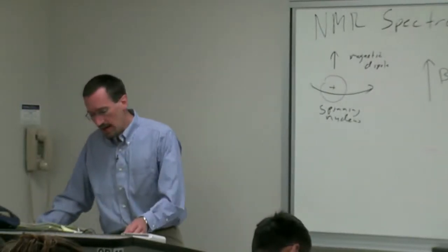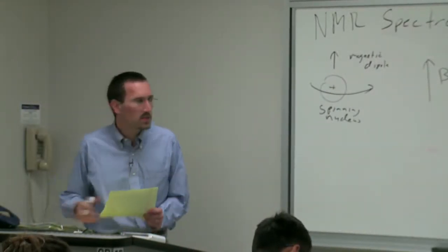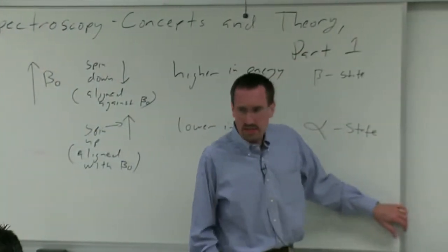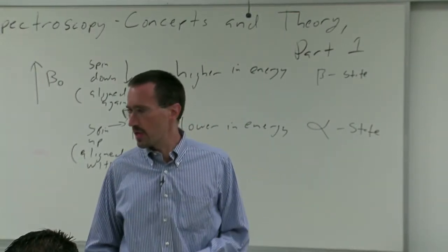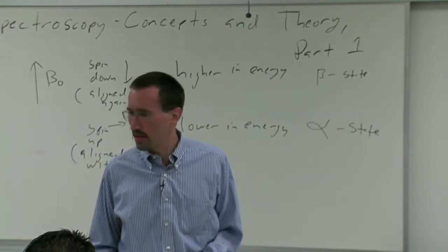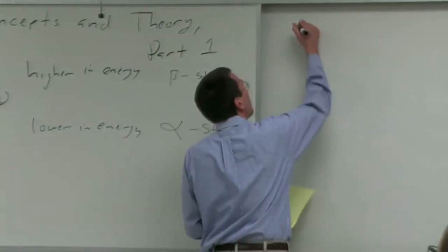Now, different types of nuclei have different spin properties. Rather than trying to start with generalizations about rules, I'll come to those in a moment, because at some point you'll be wondering in your project, well, could I study chlorine 35 or something like that? Let's just start with typical nuclei studied.